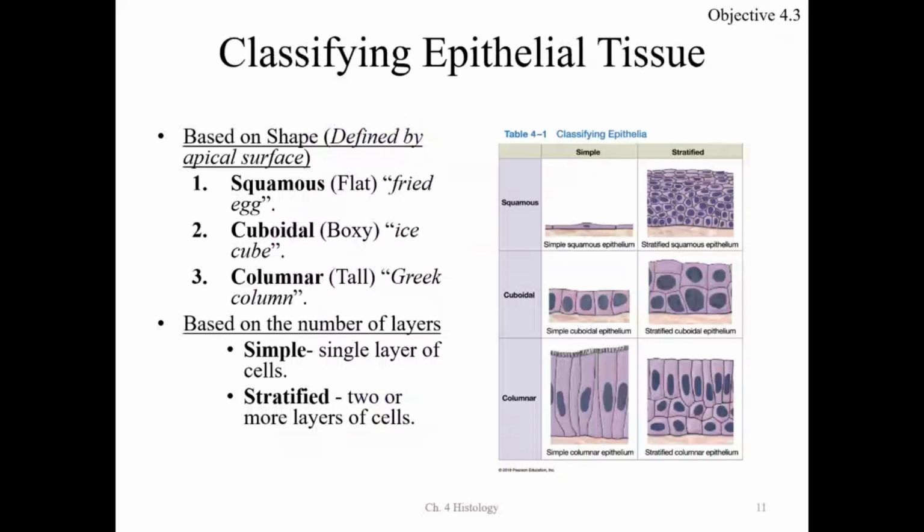If we have an epithelial cell that is very flattened, like right here, this cell is quite flat. Look up here at the apical surface. These cells are quite flat. Though these cells are boxy down here at the bottom, the cells at the very top are very flat.